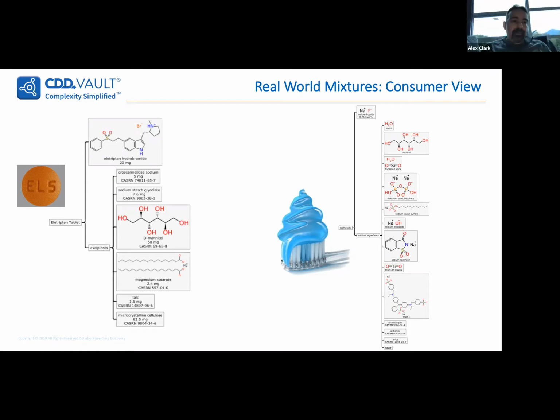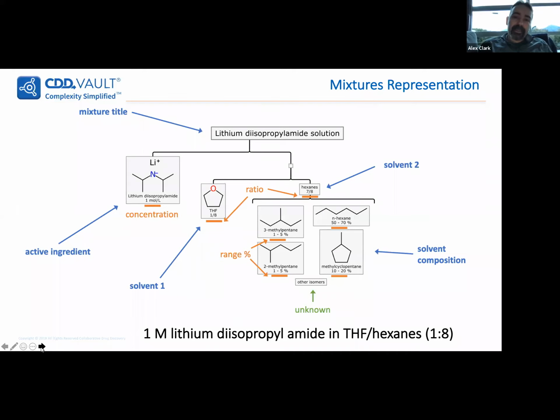Yeah, the definition of a mixture, Chris was introducing it before. From a pragmatic point of view, we say that there has to be at least one thing in there that we would be comfortable describing with chemical iconography, if you like. And there has to be some value in adding additional information like concentration, purity, and so on. And so what you see on the screen here is a medium complicated chemical reagent that you would find at the bench quite often.